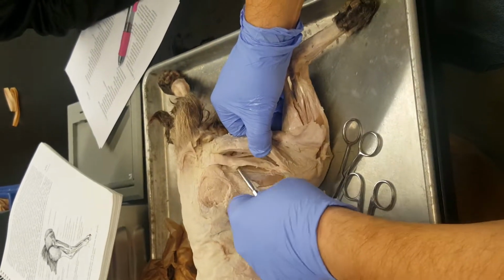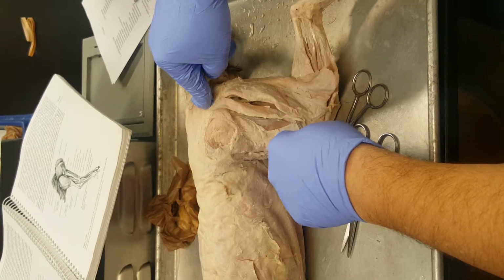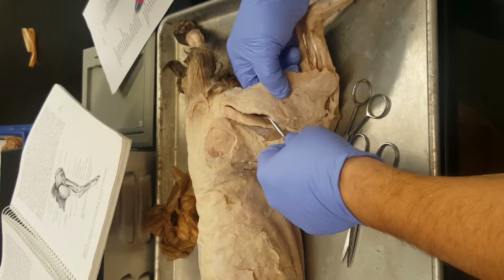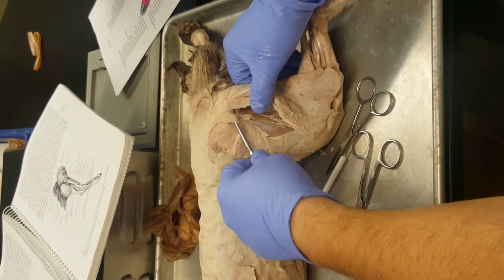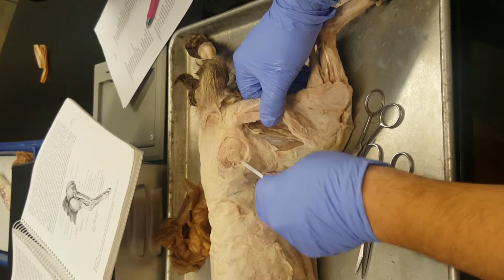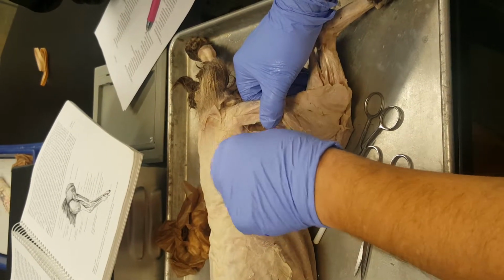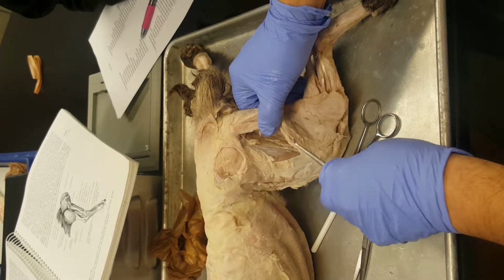Okay, on the hip, we got your biceps femoris, your cauda femoralis. Cauda means tail, goes down along the femur. Biceps means there's two heads to this muscle, and it's on the femur. Biceps femoris, cauda femoralis. Gluteus superficialis, some people call it gluteus maximus, but gluteus superficialis and gluteus medius. And the medius is bigger than the maximus or superficialis because these are quadrupeds. In humans, this would be bigger because we're bipeds.